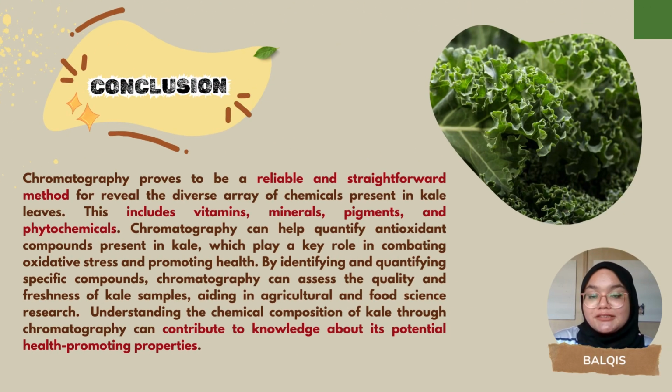Chromatography proved to be a reliable and straightforward method for revealing the diverse array of chemicals present in kale leaf. These include vitamins such as vitamin C and vitamin K, minerals like calcium and potassium, pigments such as chlorophyll and carotenoids, and phytochemicals like flavonoids and glucosinolates.